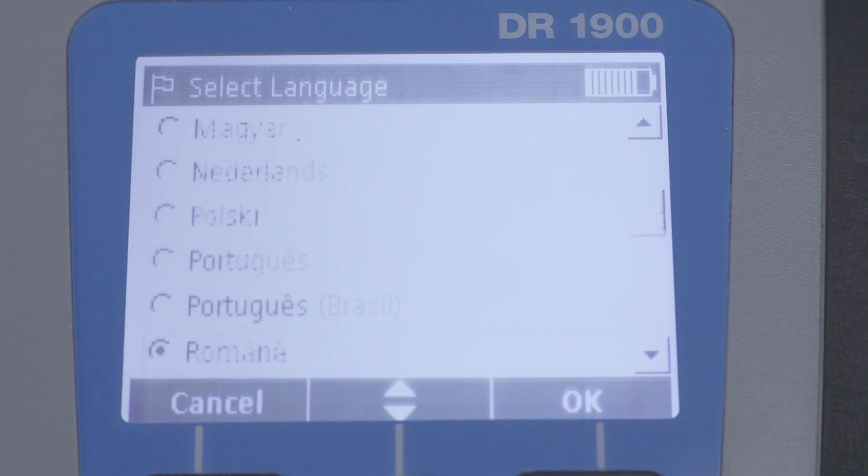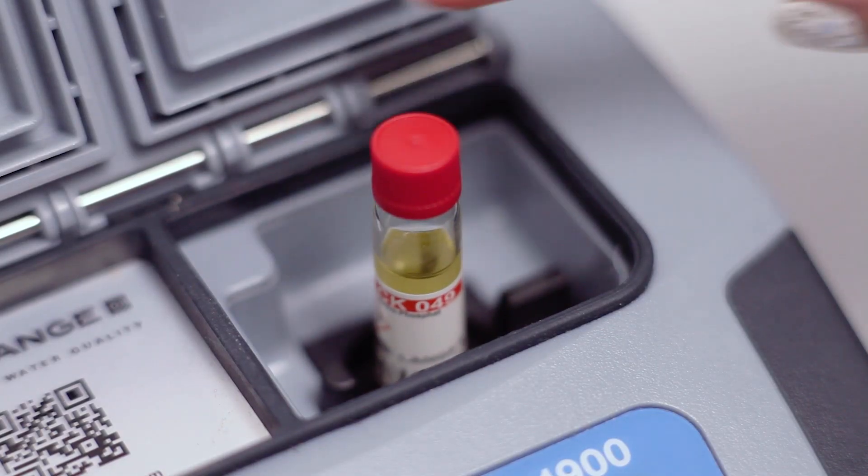After inserting the cuvette, the test method should be chosen. Then the device quickly measures and stores the test value.